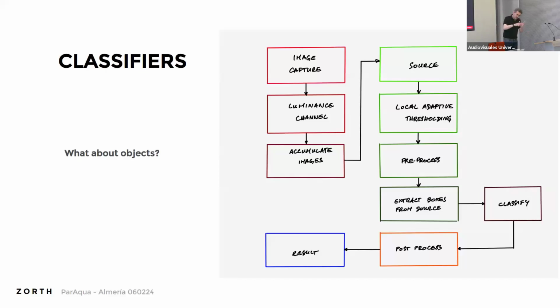I would create a bounding box around that region. I would cut the image. I would put it through a classifier here. And then after classification, I would post-process, parse the text, and produce the results. Okay. It works. It's a pain, but it works.